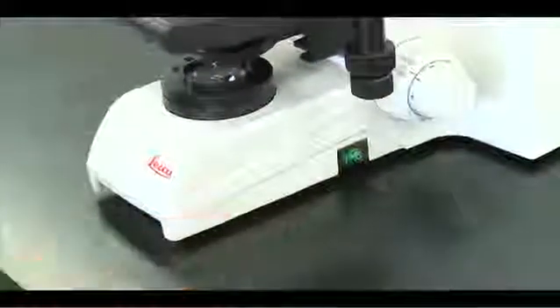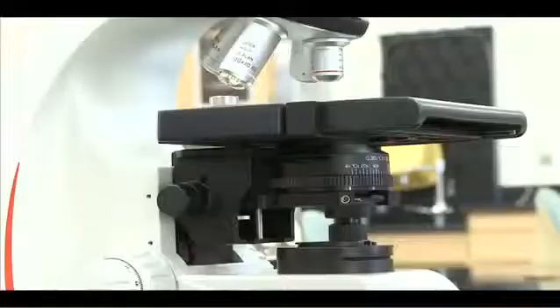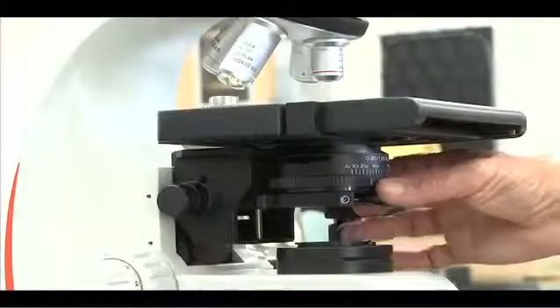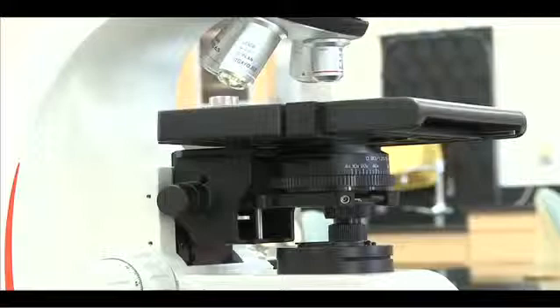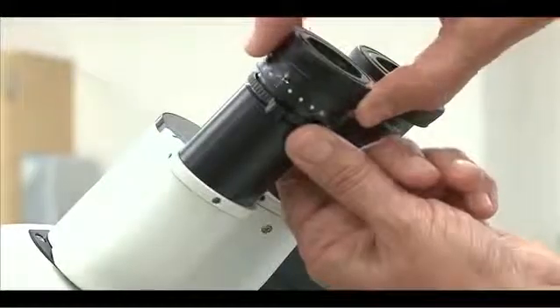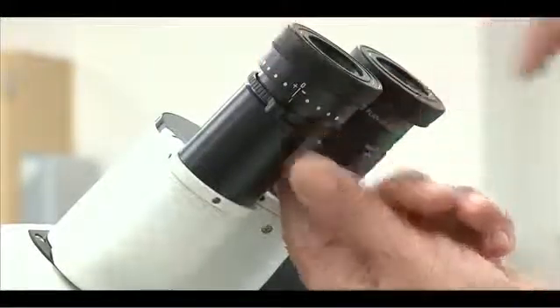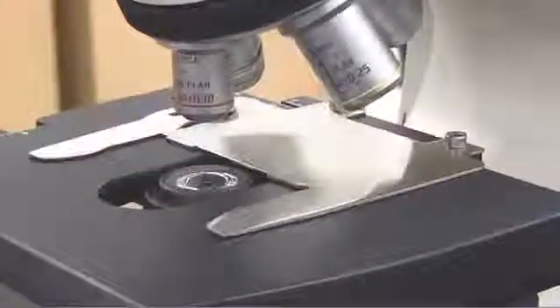Switch on the power and assess the microscope. The 4x objective should be in position. The iris diaphragm setting should always be equal to the objective power, so it should also be set to 4x. Set the focusing ocular to zero. The condenser should be set even with the mechanical stage.